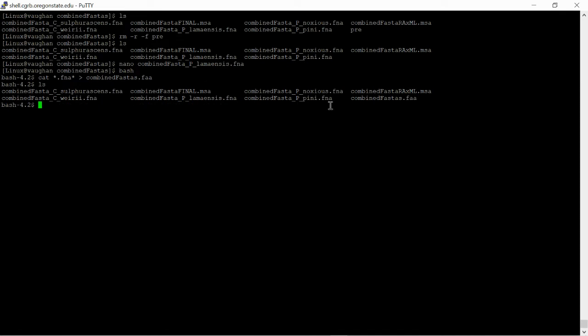And if we see here, we see this created our new file here. And so then our next step will be to use MAFFT, which is a multi-sequence alignment program. It's going to align all those different Busco genes for each sample together into a multiple sequence alignment.